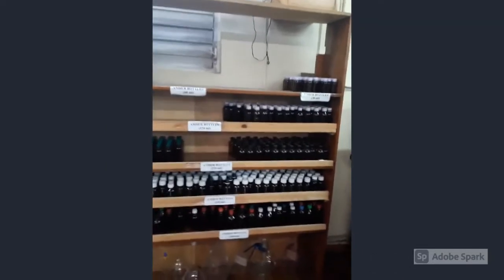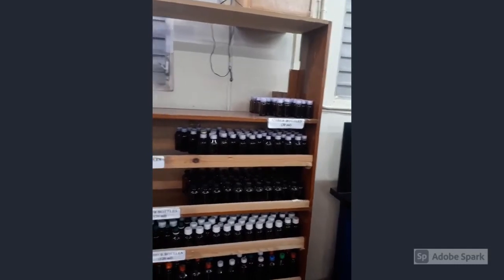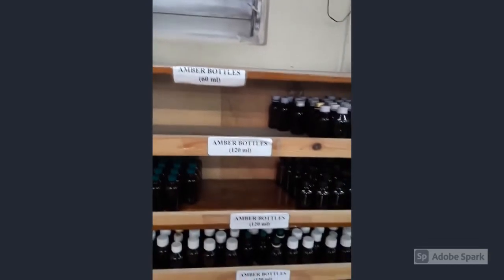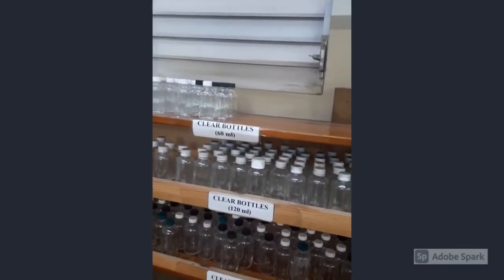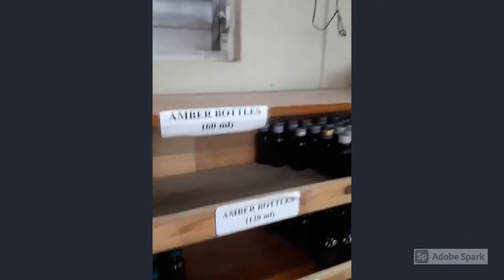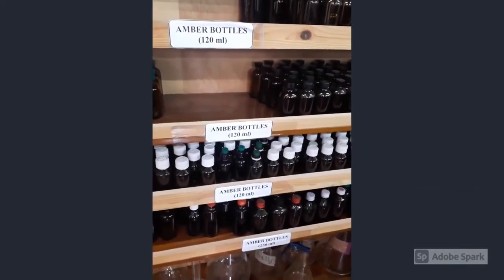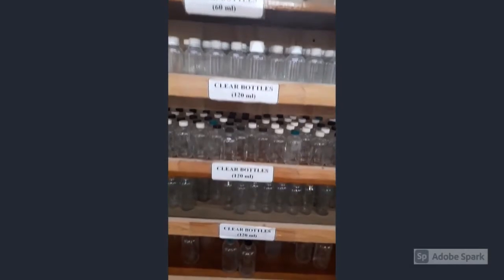Good afternoon, students. So this is where your bottles are kept for your labs, your packaging bottles for your labs, for your products. And as you can see, we have the amber bottles on this side and we have the clear bottles on this side. And they're made of glass, so please be careful with them. On this side for the amber bottles, we have 60 mil bottles, 30 mil bottles, 120 bottles, and we have up to 250. We have the same on the other side. We have 60 for the clear, 120 up to 250.